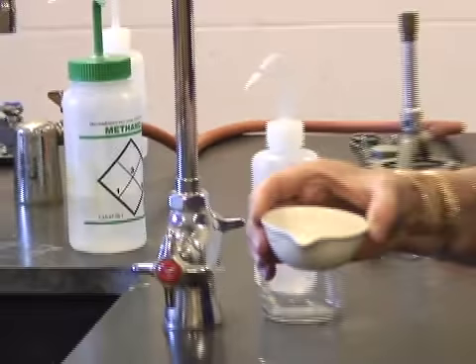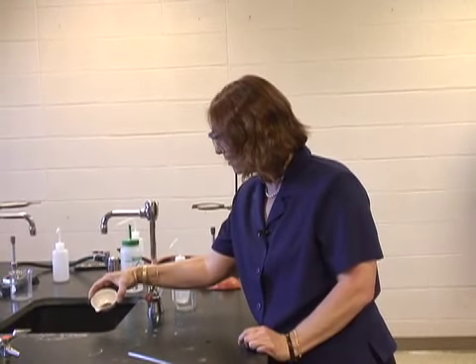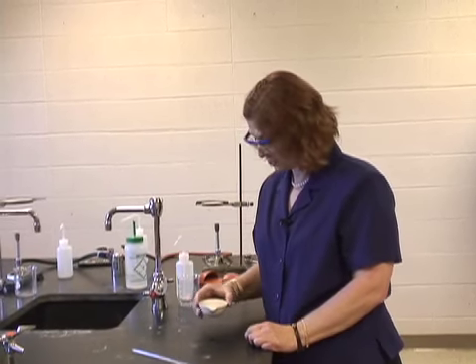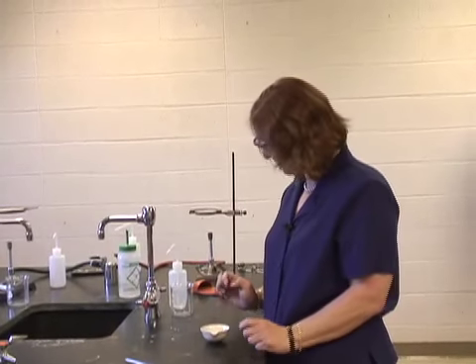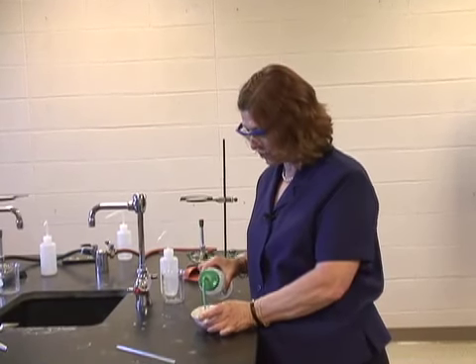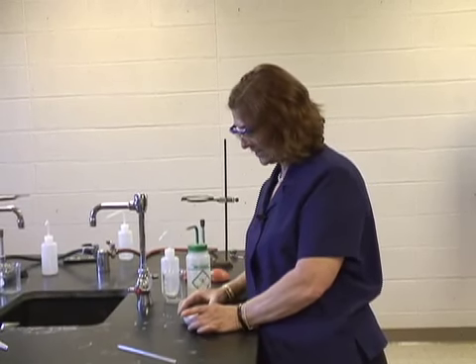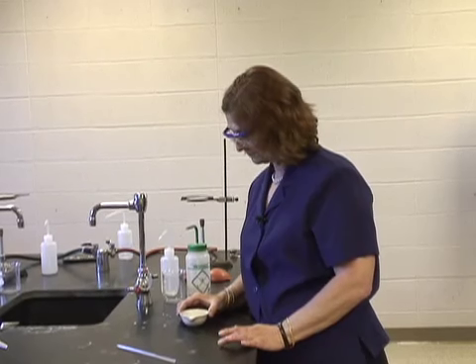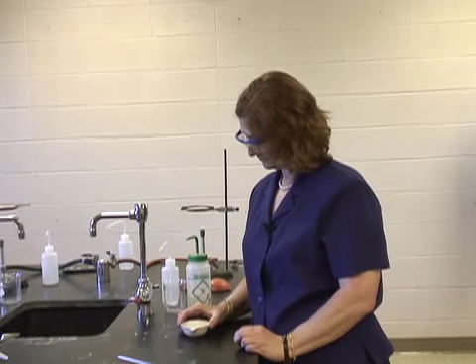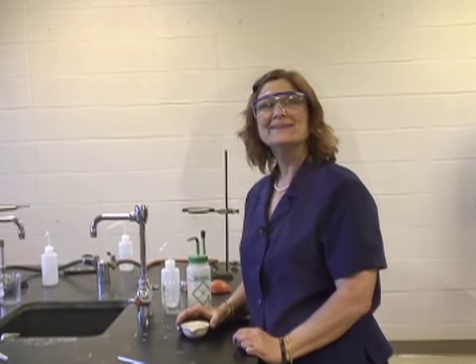Now there is a little bit of water in here, and I'm going to wash it with my methanol. I don't want to pour too much off because it seems that the copper is trying to get out. Now I'm going to put a little, it calls for 5 milliliters, but I'm just going to give it a squirt, wash it around, and I will let it settle. And I'll be right back.